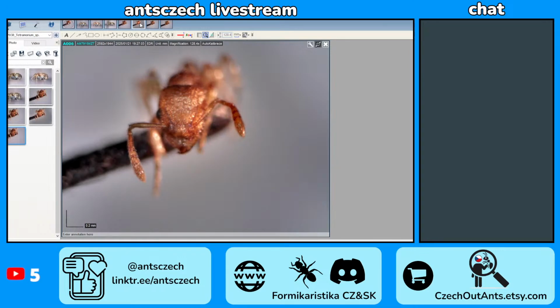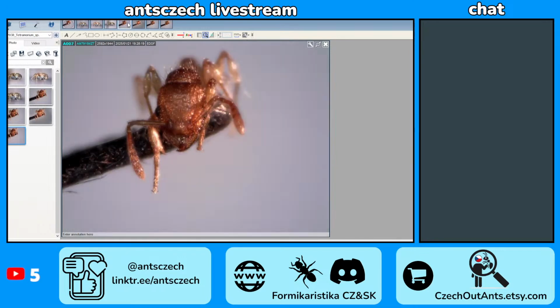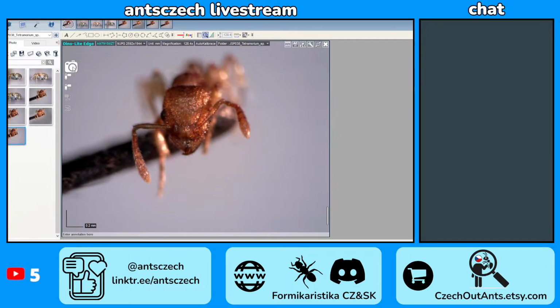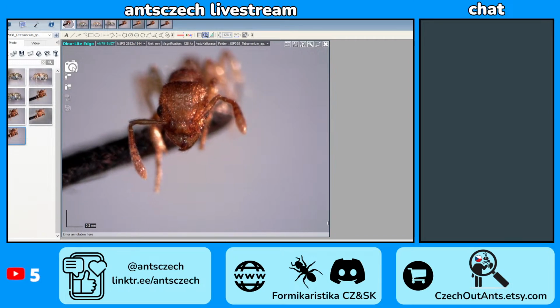Oh no, I beheaded it. I hate puberulus, because when they die and you try to pin them, their head is always stuck down below. You want to get the head up, and then the head flips completely off, and you behead them. It's annoying.